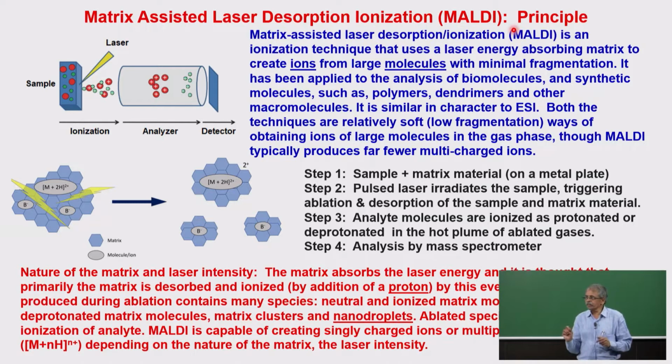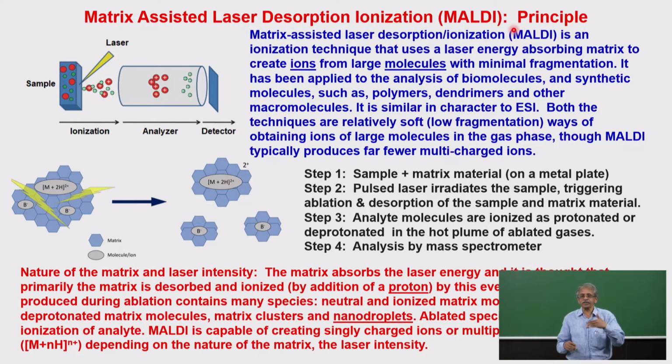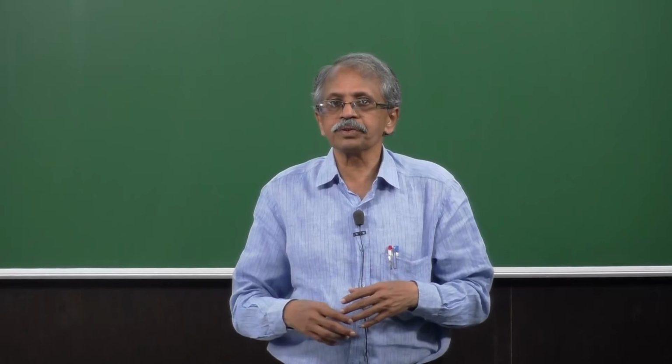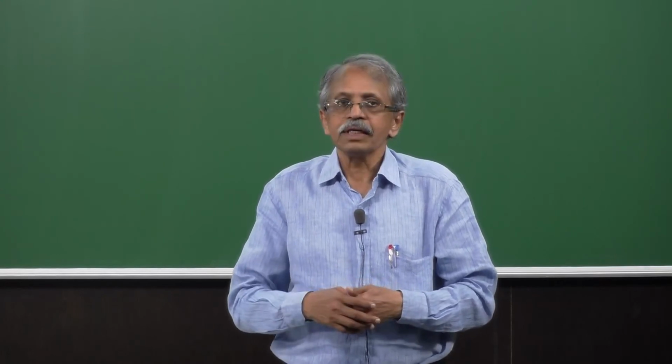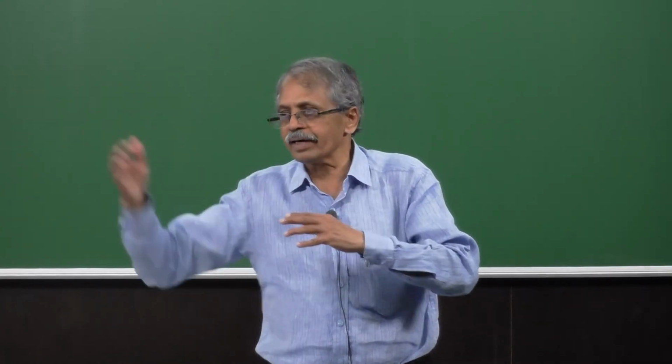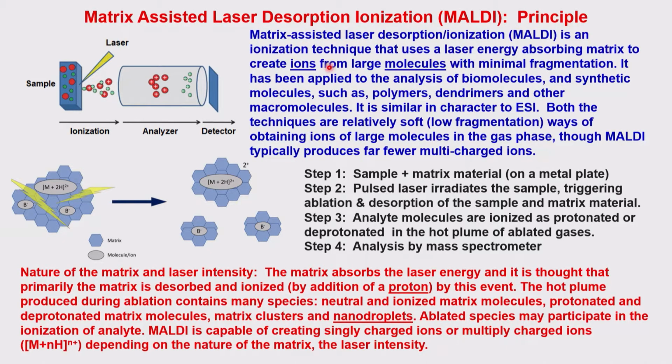So having understood the meaning of each of these words, if you combine them, what it gives is basically you take your compound in a matrix and you put some laser radiation, some suitable laser radiation. What is suitable? We'll look into details a little later. And this suitable radiation, when you incident on the sample, the matrix will dislodge the molecules as well as the matrix also. So a variety of species comes out, that is what is basically called the desorption, and these desorbed species are further ionized where you get the ionization. Now kindly please look at the slide, it explains clearly.